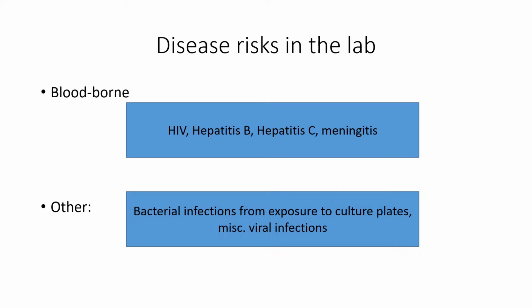Now, some things need to be manipulated in the biosafety cabinet or the hood, and that would include things like the respiratory viruses and fungi such as Coccidioides. We always want to work with anything that is a spore former inside the biological safety cabinet.